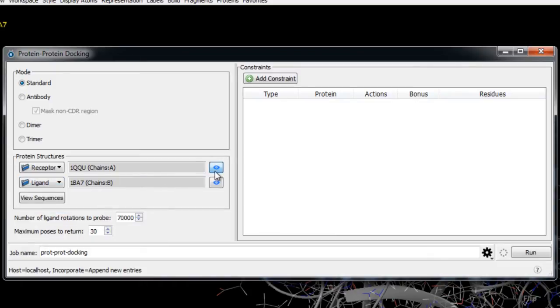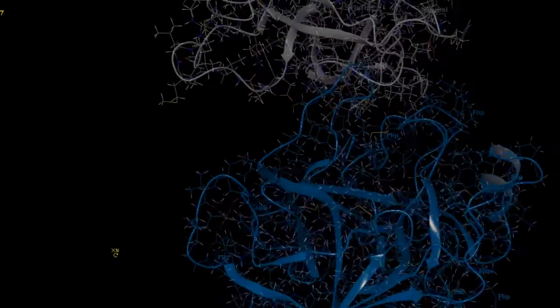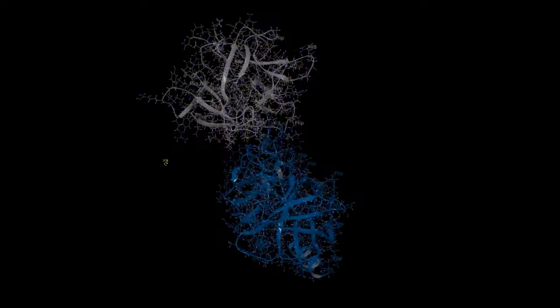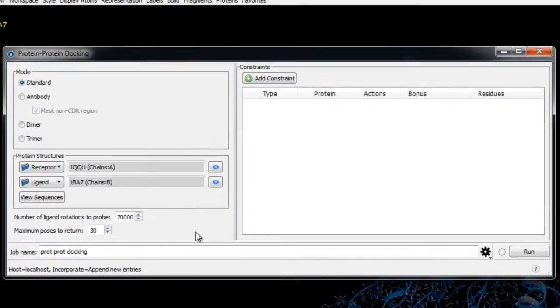We can then view both proteins in the workspace by clicking this icon. There are two parameters to control the docking. The first is the number of ligand orientations to the receptor that are sampled. You can set this value in the number of ligand rotations to probe — the maximum value is 70,000, which corresponds to approximately sampling every five degrees in the space of the Euler angles.